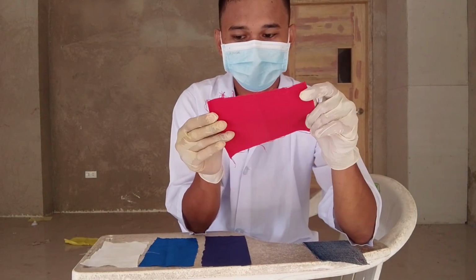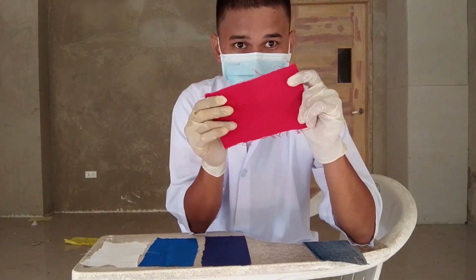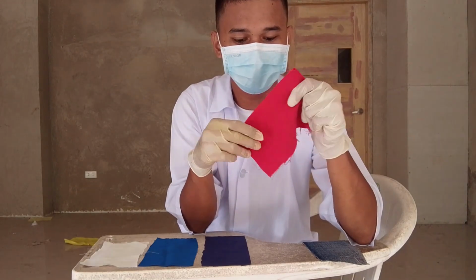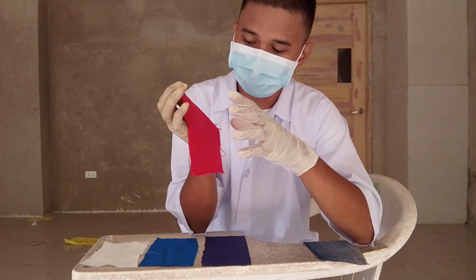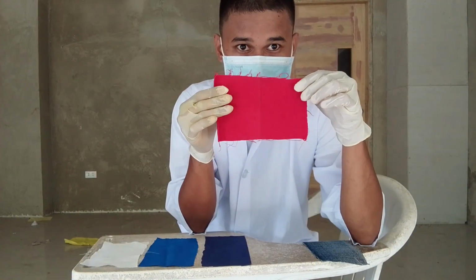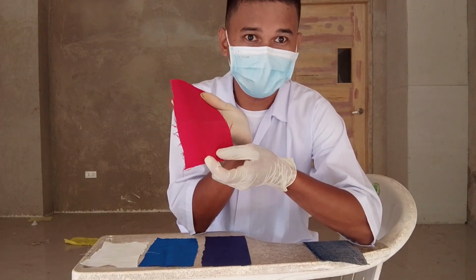The cotton is commonly used for everyday clothing, and the color I use is red cotton. The texture of the cotton is soft and comfy to wear as a fabric. And the size and shape of the red cotton is rectangle, and also 3 by 6 inches.